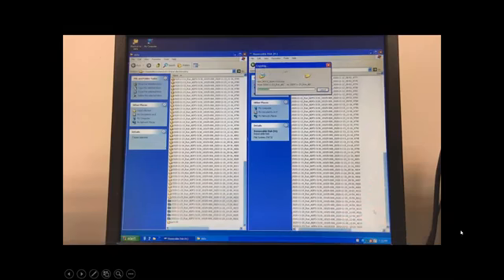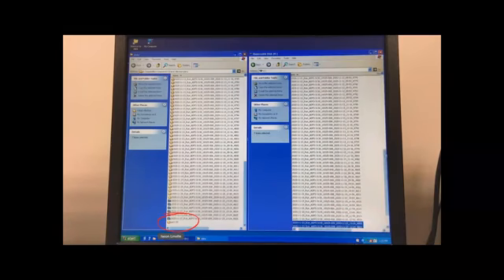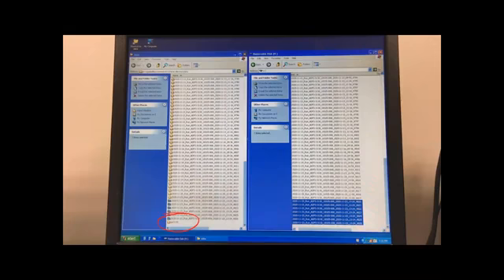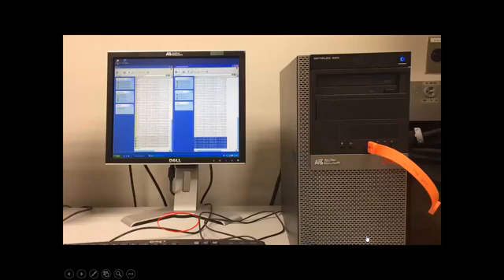I also want you guys to notice that little GA3130 folder. Leave that alone. That does not get copied, but don't delete it because it's necessary. It contains certain matrix files and, I think, the spectral files, and everything will get messed up if that gets deleted. How's that for scaring you?